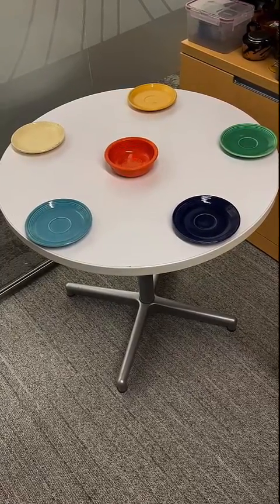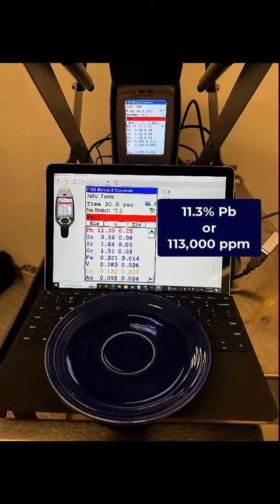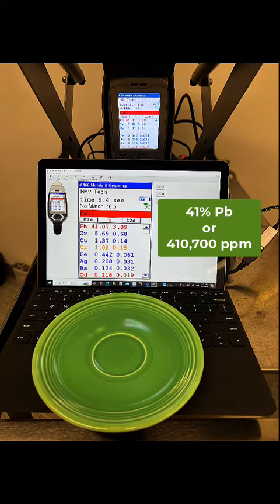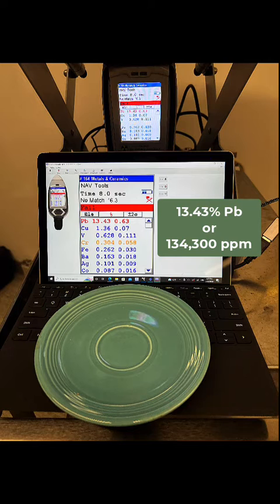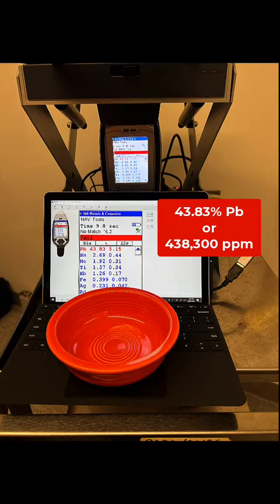If we put this in the XRF, we could test each one of these and get various readings. You see that the blue glaze is 11.3% lead, 23.75% lead for the gold, 41% for the green, 13.5% more or less for the light green, and 20.29% for the yellow.